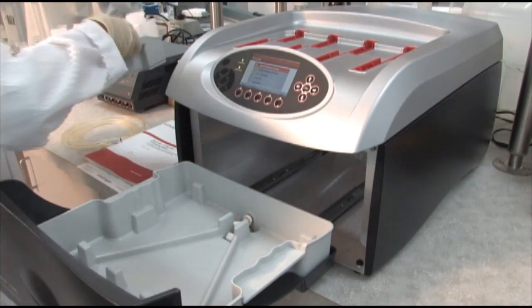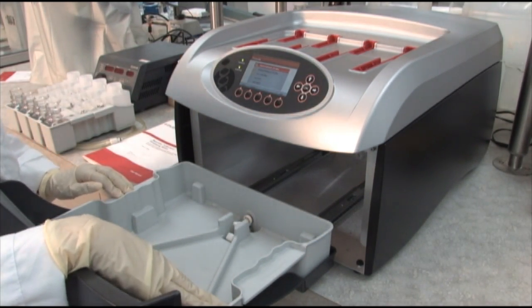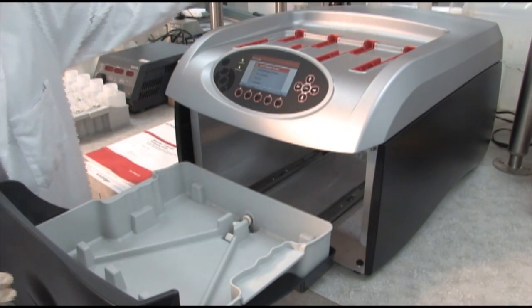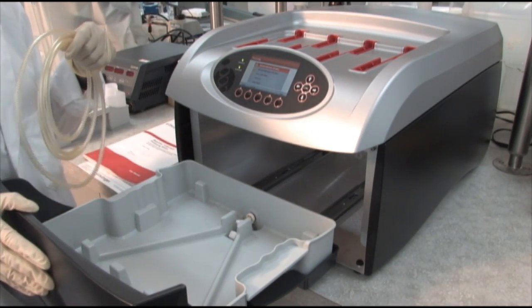Underneath the reagent tray is the waste basin. This is where the used reagents are dumped. A hose provided with the instrument, which plugs in at the back, allows you to drain used reagents directly into a sink.